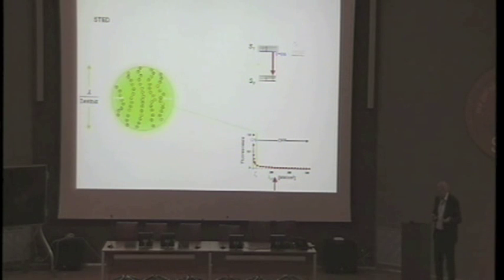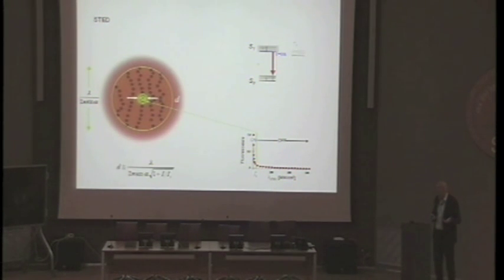And the conceptual limit, of course, as I said, is easy to answer. It's clear that if you shut off more molecules, or more molecules on average, then we will have a higher spatial resolution. And this is also reflected here in the equation. If you look at the equation, if I gets large over S, then D goes down to 0. So 0 means, oh, what does this mean? Well, 0 is not to be taken perfectly literally.